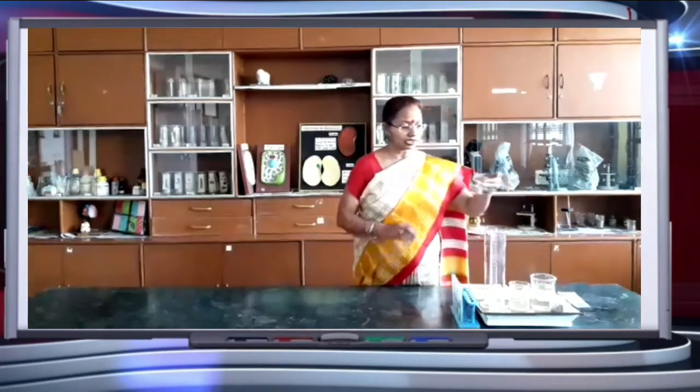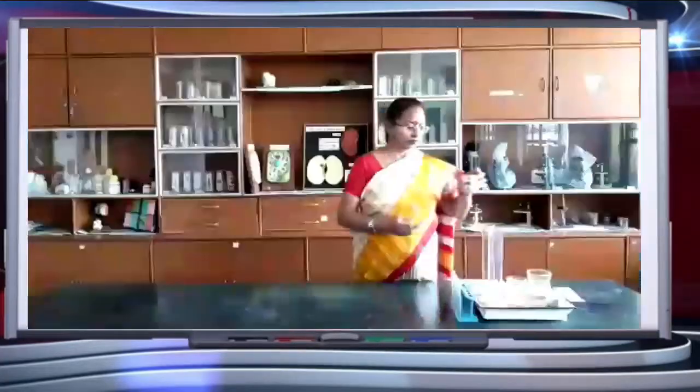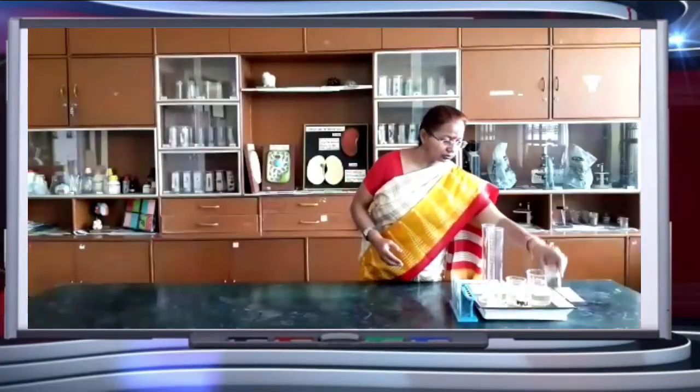In this activity, students, we are going to study texture and pH of soil which are collected from two different sites. Let's see what all we need for this experiment. We need two different samples of the soil. I have labeled it sample 1 and another one is sample 2.